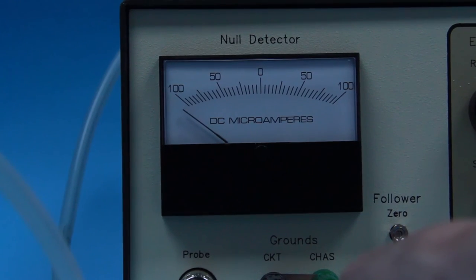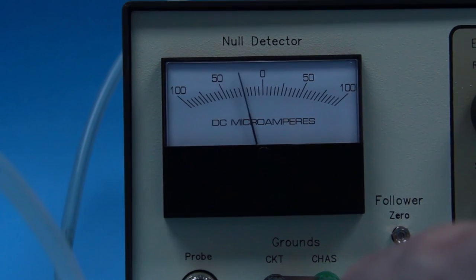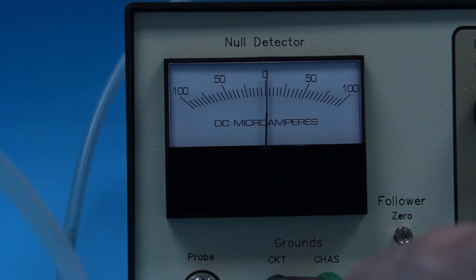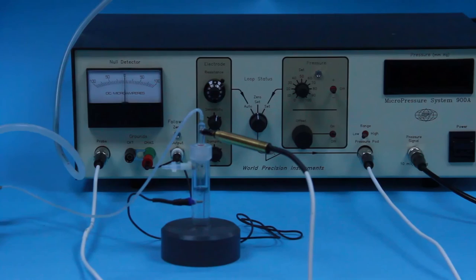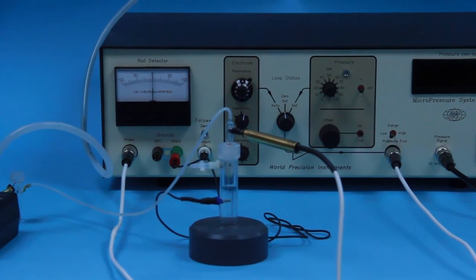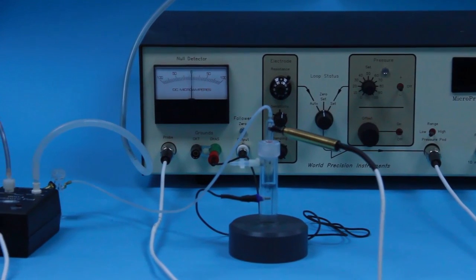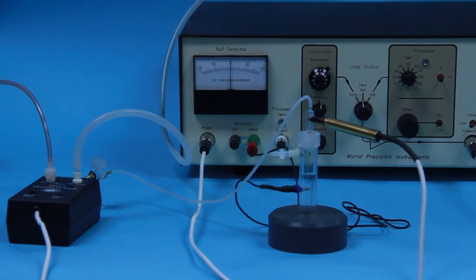The response time of the piezoelectric valve is 0.5 milliseconds from fully closed to fully open. Overall system response depends largely on the amount of residual volume in the tubing. When this volume is small, the system responds very rapidly, typically 10 milliseconds.